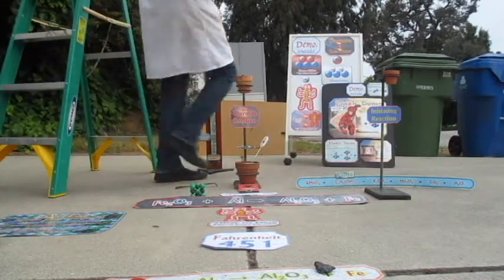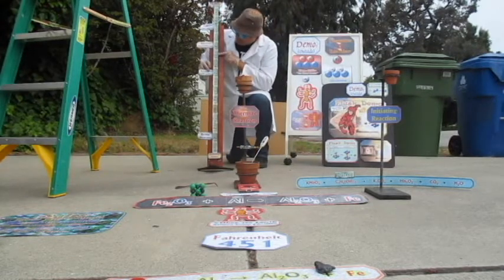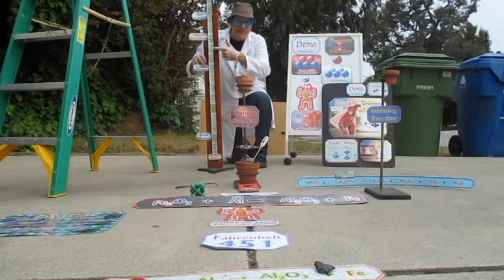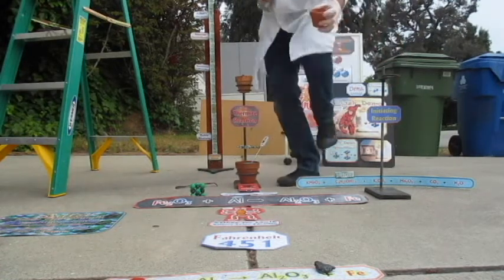So we've got the thermite reaction, the big reaction. We're reacting aluminum versus iron. Who's going to win? Who do you think is going to win? Aluminum is going to win. So that's in here. But before that, we're going to try the initiating reaction with this black powder.